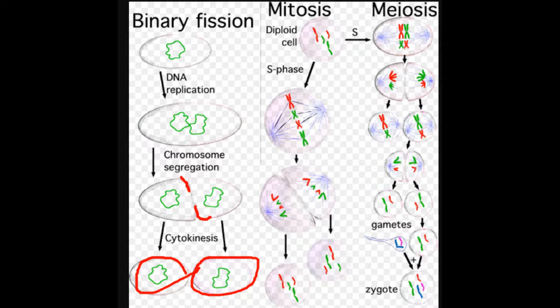The simplicity of this process also drives what we're going to do in lab today, which is we're going to be able to give the bacteria new abilities just by our manipulations right here in lab. It's quite exciting. This is really what scientists do in the lab.